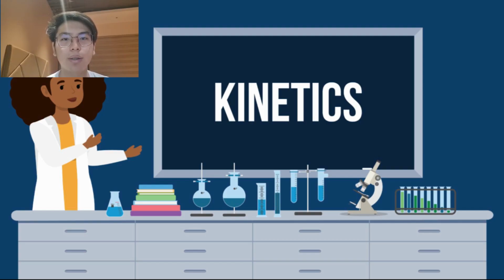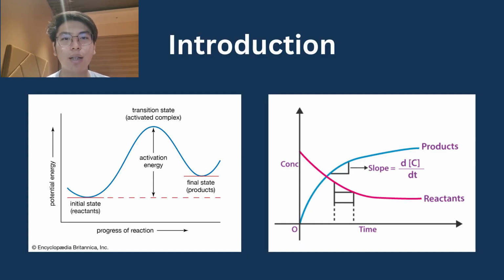Today we'll be diving into the topic of chemical kinetics. Chemical kinetics is the study of rates of chemical reaction. It is the changes in the concentration of reactants and products with time. Today we'll be conducting an experiment where we will be investigating the reaction between blue food dye and hydrogen peroxide in the presence of a base.